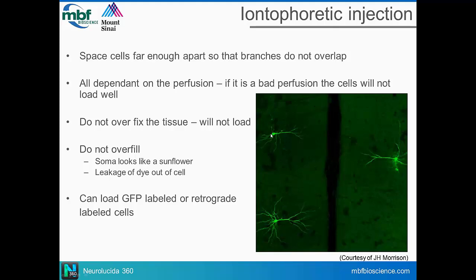You kind of want to get the cells that come into view second. If you inject those ones, you really will get nice dendritic trees, with minimal abrupt or cut branches. I mean, that can happen in anything because it's a 3D structure, within the good working distance of your objectives on your microscope when you start imaging.